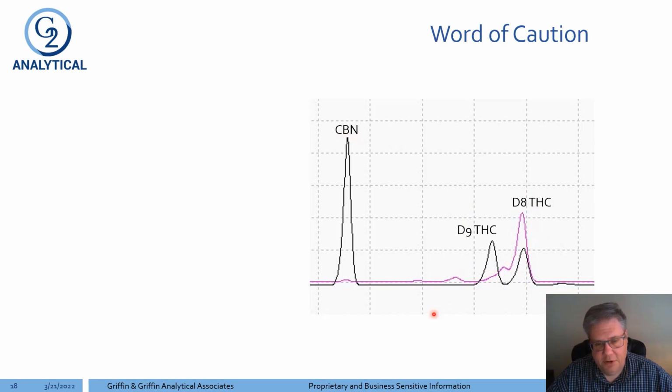So I've zoomed in real close right here. As you can see, just using 228 nanometers, this is the kind of resolution that you get. This guy right here gives me no concern, no pause, right? I mean, I'm good to go right here. Certainly much greater than the required resolution between those two peaks.